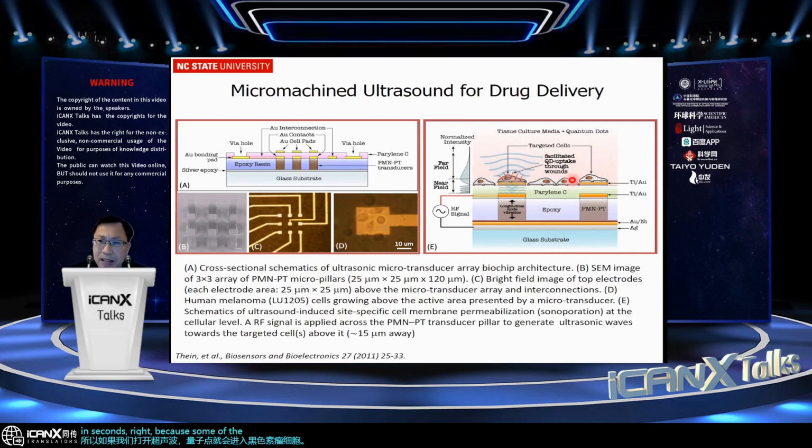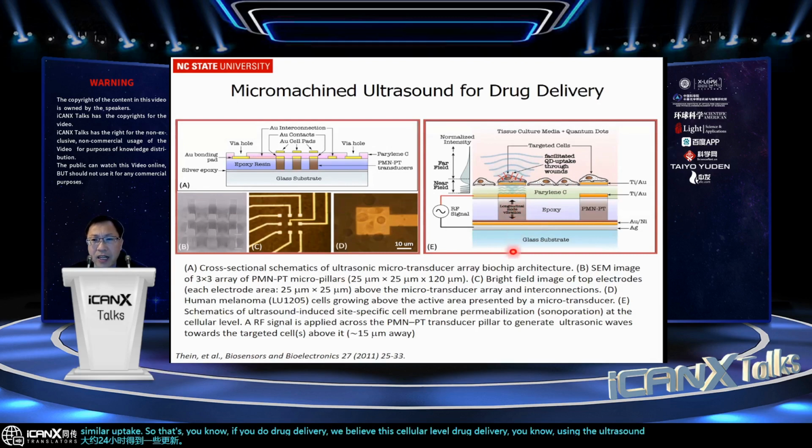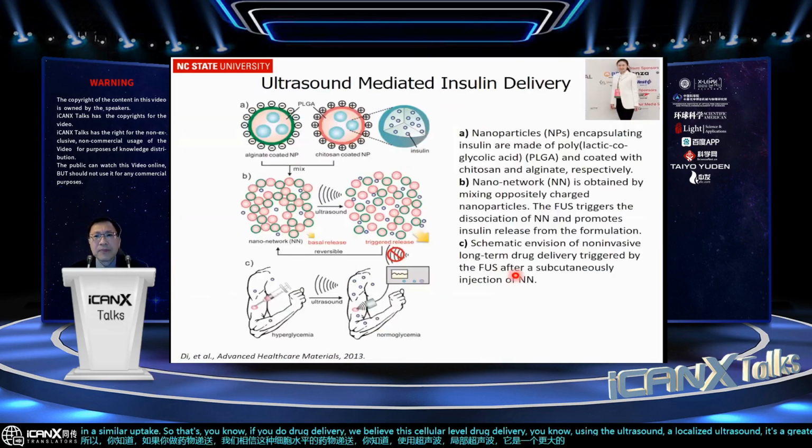That is because of the sonoporation. Cells without ultrasound sonication take about 24 hours to get a similar uptake. So for drug delivery, we believe this cellular-level approach, using localized ultrasound, is a great way to enhance drug screening.